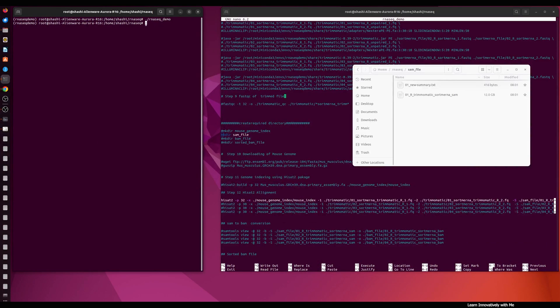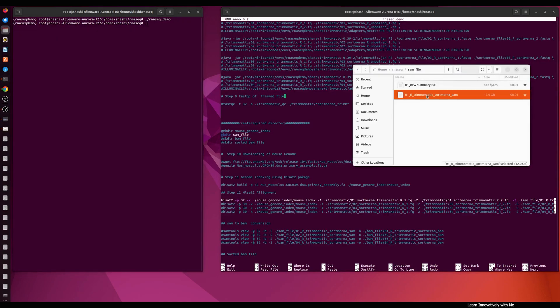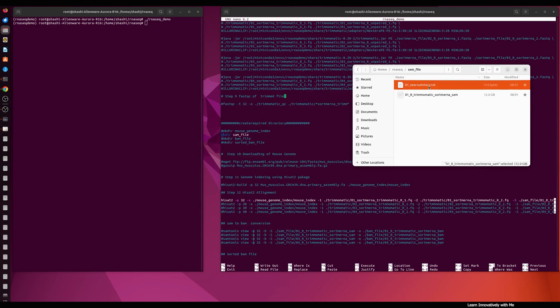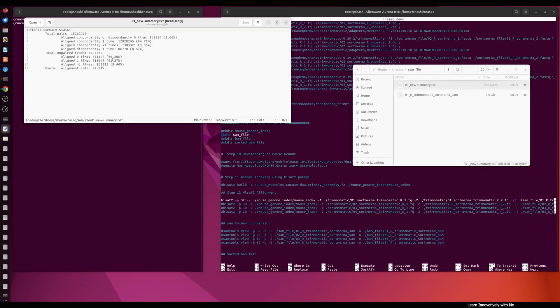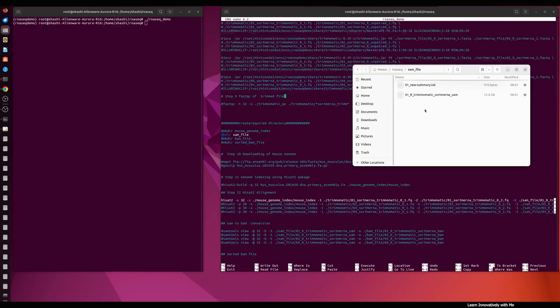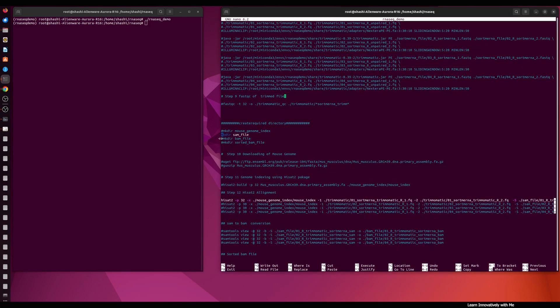The alignment is complete for read 1 and read 2 for sample 1. You can see the SAM file here at 12.0 gigabytes. If you open the summary file you will get the details of the alignment. In this way you can align your FASTQ files in the conda environment using the HISAT2 tool. Now I'm going to comment out this command in the script and move to the next step: SAM to BAM conversion.